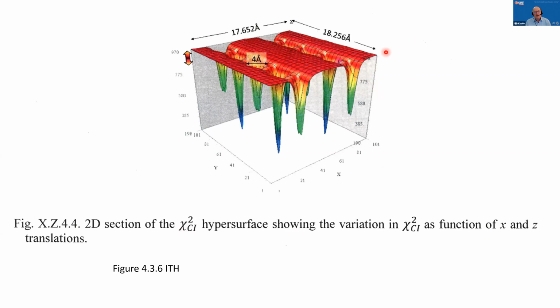And the point here is there are huge numbers of terrible crystal structures for any molecule or any chemical system. And then there are often a number of plausible ones that sit at the bottoms of very deep and very narrow minima. And least squares will get you, say, from here to the bottom of one of these wells, but it can't get you from one well to another. So you have to take other strategies to be able to sample all these wells.